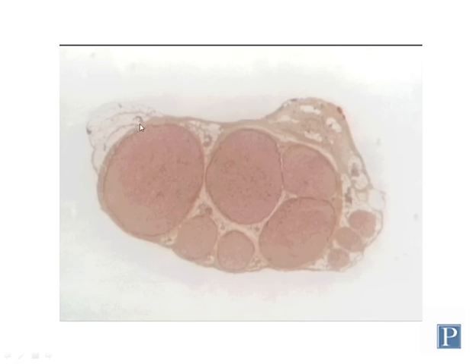The outermost layer, which surrounds the entire nerve structure here, is called the Epineurium, and the Epineurium is composed of dense irregular connective tissue. So if you look at it closely, you can see lots of collagen fibers and fibroblasts because it's a type of dense irregular connective tissue.